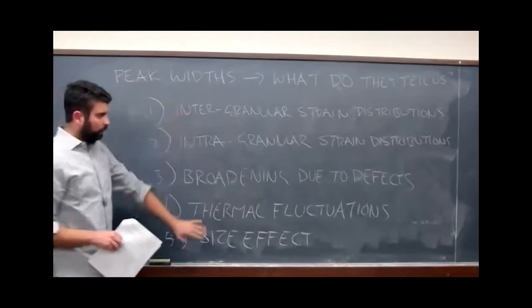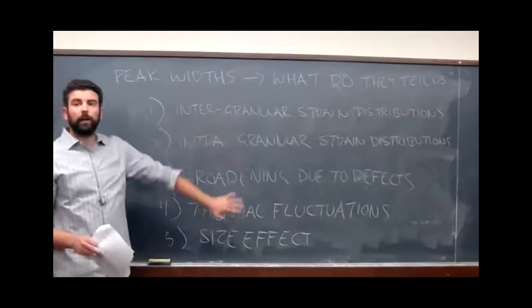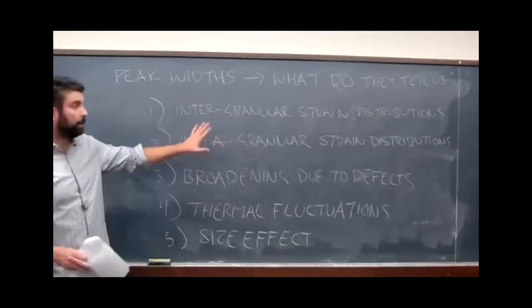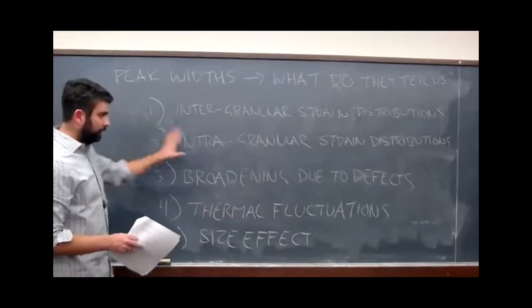So the reason I bring all this up is I just want to make it clear that there is a lot going on in those diffraction peak widths, and that it's still an active area of research to be able to tease all this information out all at once. But it is in there.